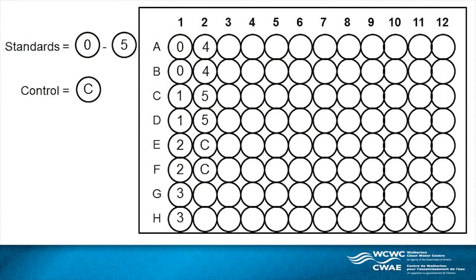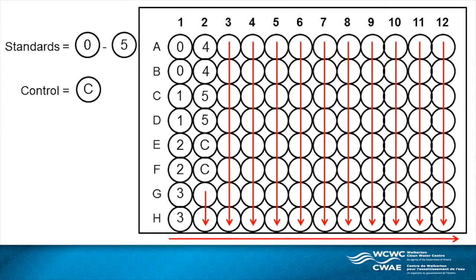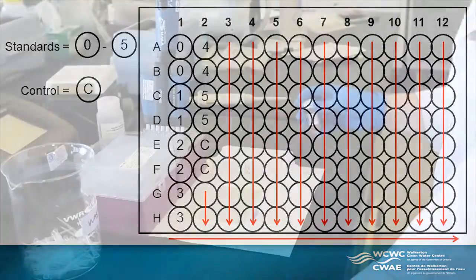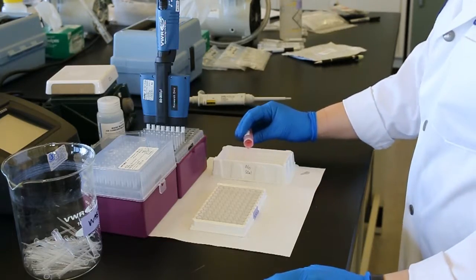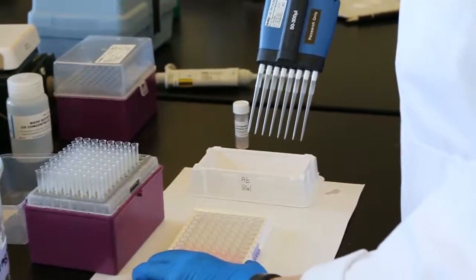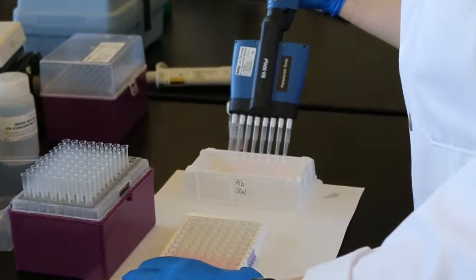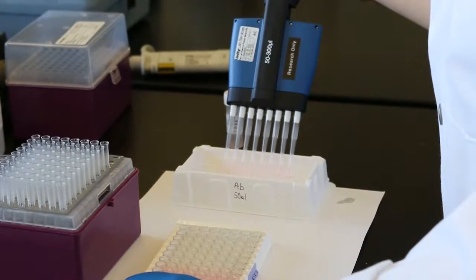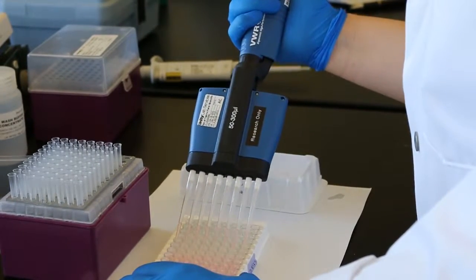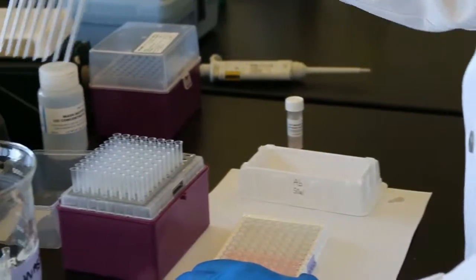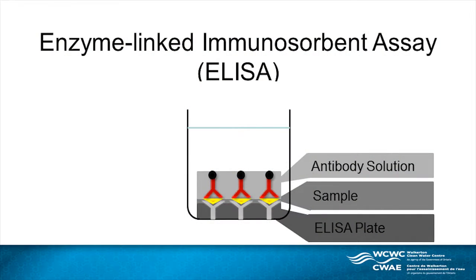A plate map should be used to record the position and contents of each well to avoid cross-contamination. The antibody is inverted and poured into a clean tray. 50 microliters of the antibody solution is added to all of the wells using a multi-channel pipette. Pipette tips must be changed if they come into contact with the well contents. Upon addition of the antibody, the wells will be tinted pink.